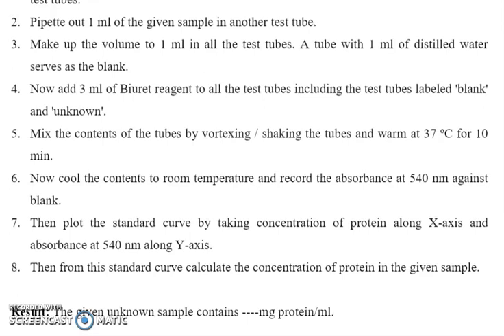Your sample should be prepared carefully. Whatever measurements I have given in this video, you can just follow the procedure. Then you will get your results, and whatever the unknown sample contains, you have to report in milligram protein per ml. And this BSA is bovine serum albumin.